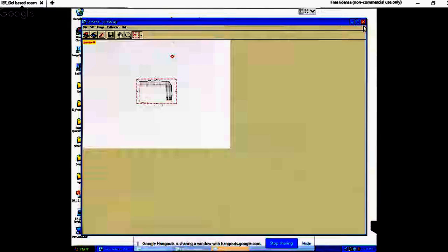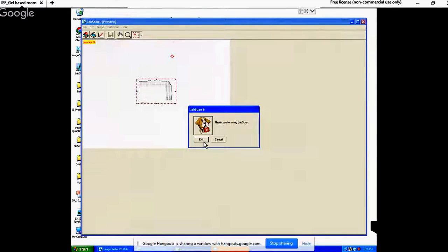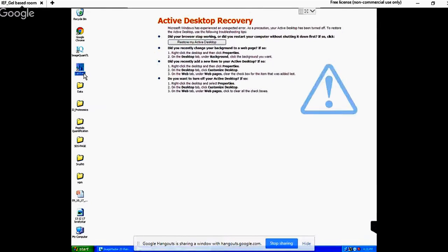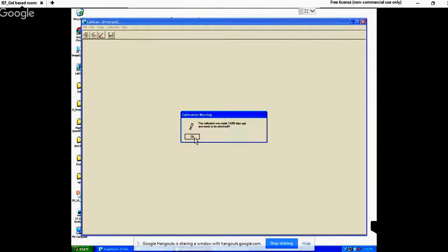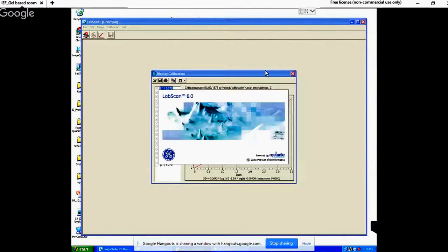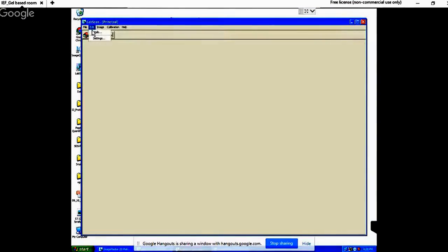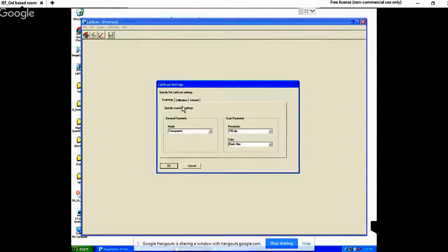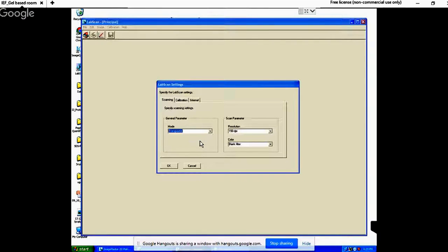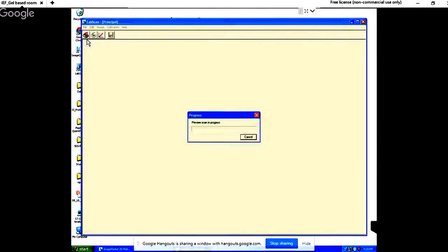In the software, we first check the settings. We keep the mode as transparent. Sometimes we also scan western blot membranes, for which we would change to reflective mode. In this case we keep it in transparent mode. The instrument first performs a preview scan — it scans the entire area and the entire surface — and after this preview scan the main scan happens.